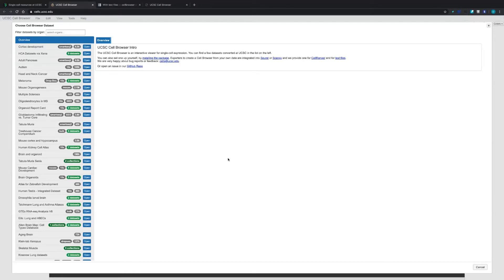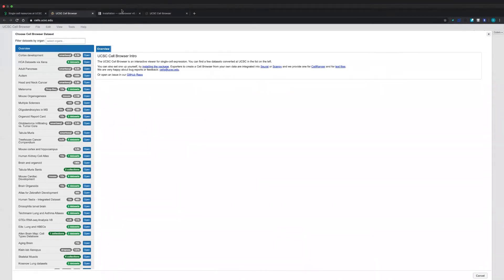The files you need to generate this kind of UCSC Cell Browser can be the RDS file generated by analyzing your data using Seurat, or can be the results directly from Cell Ranger, or can be text files including the expression matrix, cell annotation metadata table, and the cell embeddings. If you want to know how to generate this kind of cell browser, you can check their installation and setup instructions website.